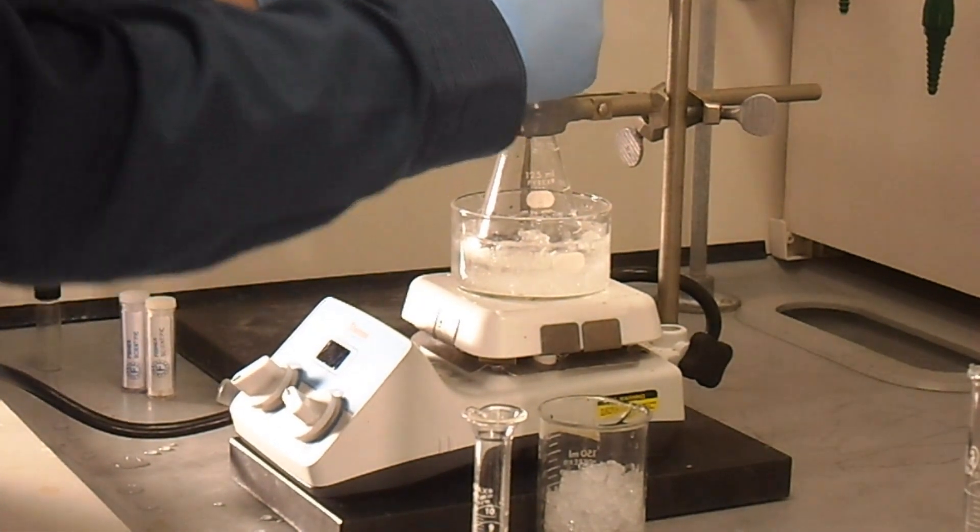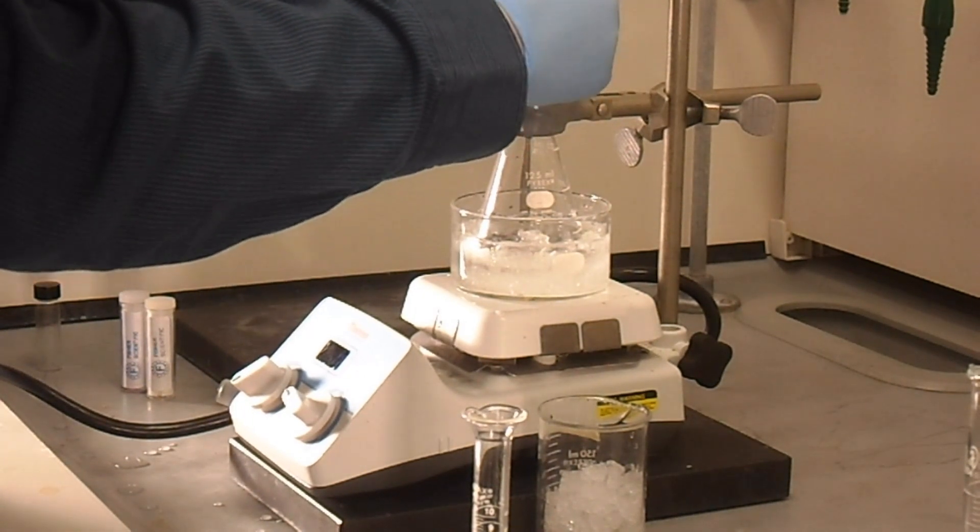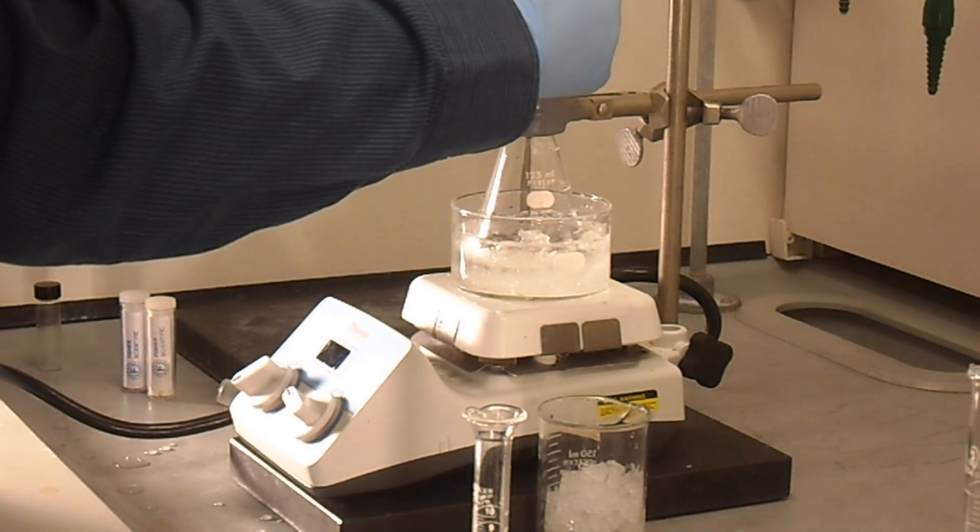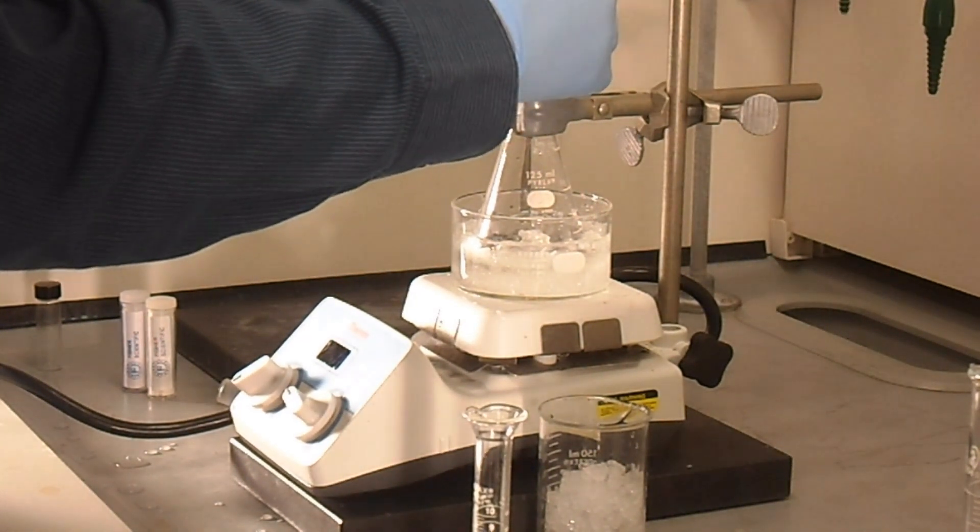So once that's been situated, we're going to open our stopcock to just dropwise. This way our bleach will be added into our reaction at a dropwise rate for about four to five minutes.